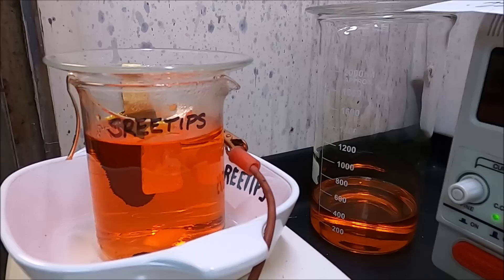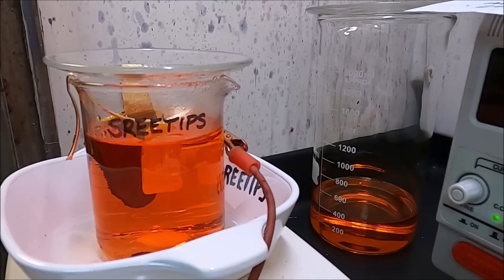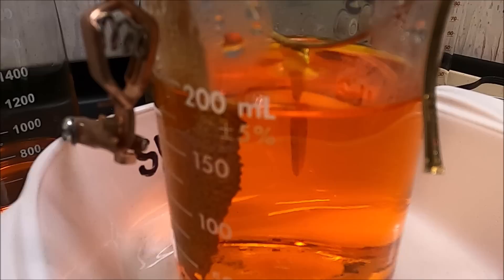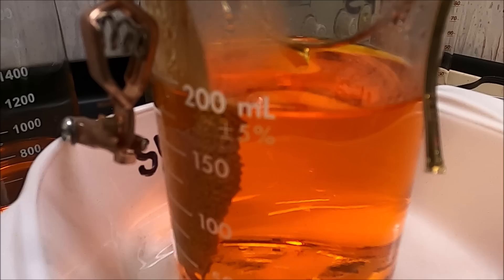We're running the cell at 1.5 volts, negative side to the cathode in the back, positive side to the anode bar suspended in the electrolyte. Here you can see the anode bar dissolving, passing through the electrolyte and plating high purity gold on the cathode. You'll watch the bar completely dissolve and fall off.